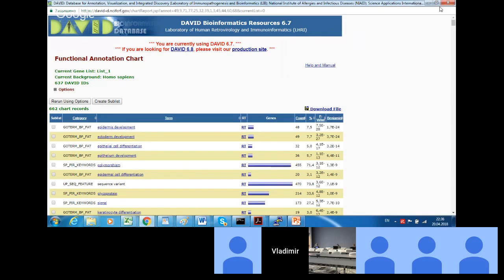Here we simply ignored p-values. We ignored even the directions of changes of genes. We set hard thresholds. So if a gene satisfies these thresholds, we included it into the list. If a gene was very close but was not inside the zone, it was completely excluded from the list.